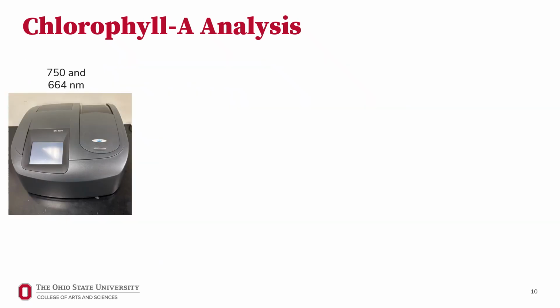I am going to go over the steps for Chlorophyll-a analysis. You can follow along with the Laboratory Analysis Week 2 section of your Ash-Free Dry Mass and Chlorophyll-a Laboratory Handout. First, each student should practice pipetting. I myself like to do some practice pipetting before I start any analysis, because I find that it really helps improve my accuracy. Remember to wear gloves for this lab, both to protect our hands from the acetone and to protect our samples from being contaminated by anything that might be on our hands, such as soap or lotion.